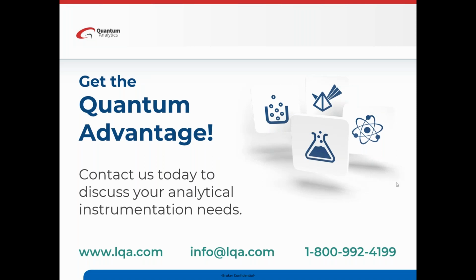Let's get started. All right, the first question here, Tom, is how easy is it to modify the software to be in line with our lab's SOP? So what normally happens is when you get the system installed, or if a salesperson sells you the Alpha or Bravo, they'll come in and just introduce it to your lab. They'll ask you a few questions. Do you have an SOP in your lab? And they'll set it up in what we call the OVP, or the operational validation program, which is right there in the software, and they'll configure it exactly as you want or use in your lab.